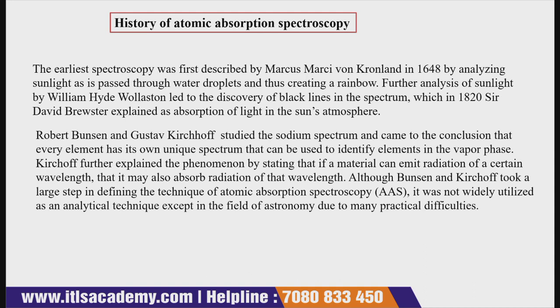of light takes place. Then Robert Bunsen and Gustav Kirchhoff studied the sodium spectrum and came to the conclusion that every element has its unique spectrum that can be used to identify elements in the vapor phase.